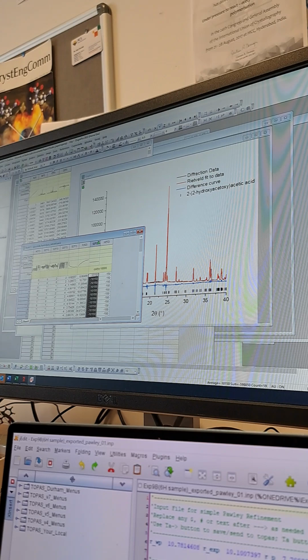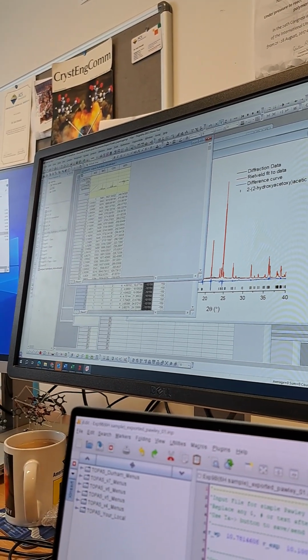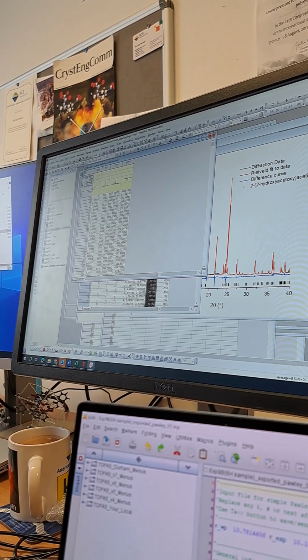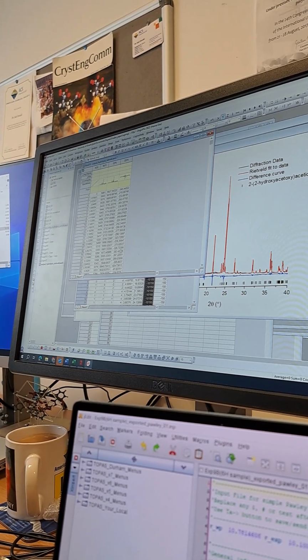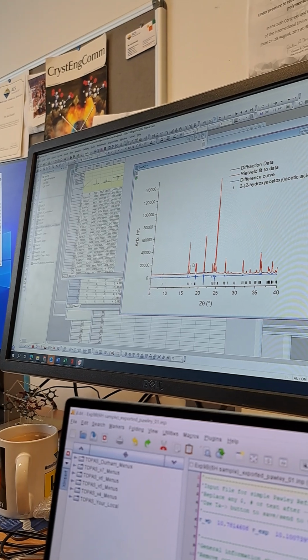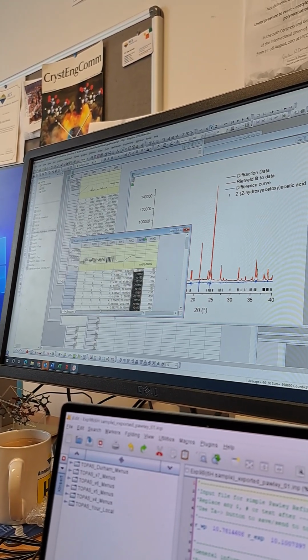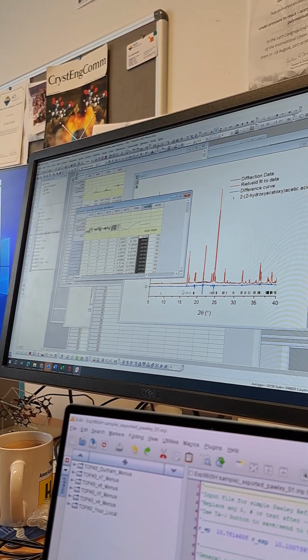Now the output of this is in this format. So your output.ascii is this, where you've got 2 theta, y observed, y calculated, and difference. Okay, so all I've done is essentially put them all into one graph. I've just dragged them all in. For this one here, you need to work it a little bit. So this is the other graph.